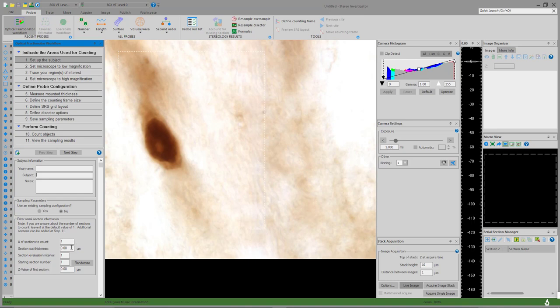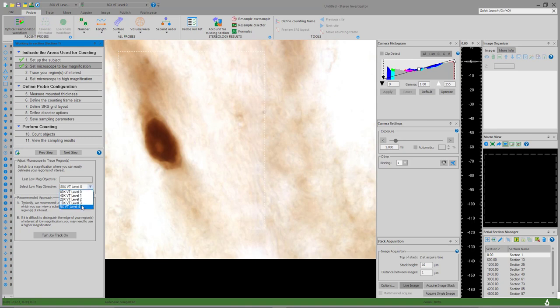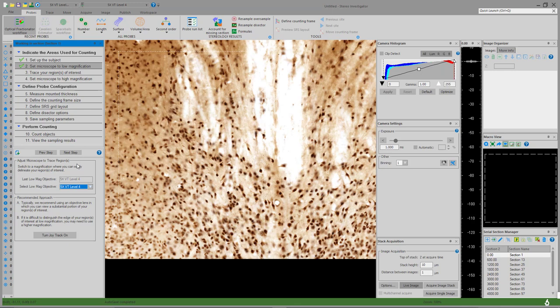On the next step, we want to go down to low magnification. For bright field, that typically means the lowest magnification objective on your system. For fluorescence, you're sometimes not able to visualize your tissue well at 5x or 1x, so you may need to work at 10x or 20x as your low magnification or tracing objective. Once we've selected that objective, we can proceed to the tracing step, where we trace our region of interest. We can select the contour type from the list, and there are gear icons throughout the software that let you click to open relevant options to change contour type, color, or other settings.